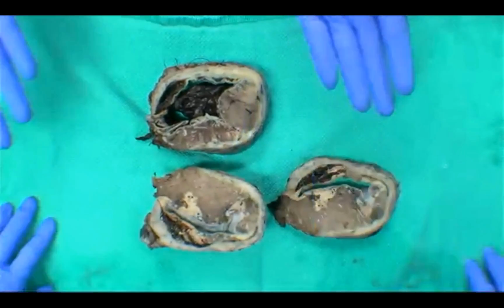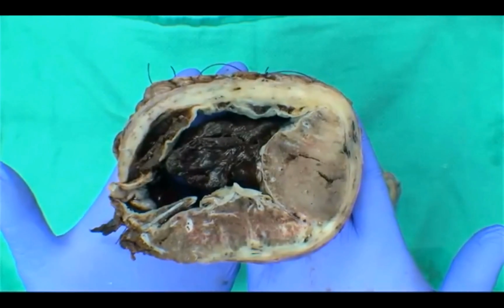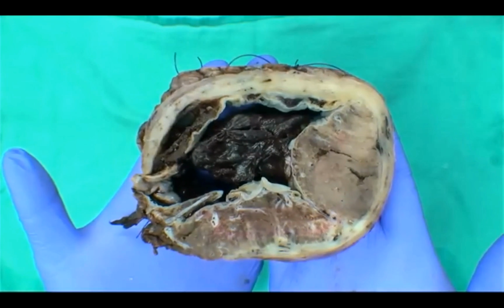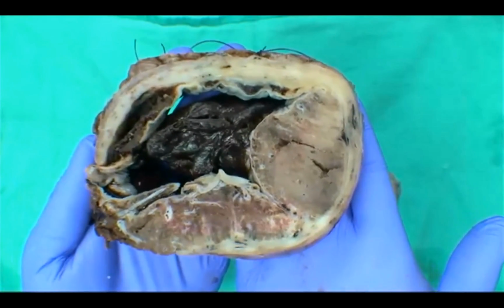So I'm going to pick up these individual slices and then. That's my hand modeling for today. So this is something that you can expect on cut surface. Actually, we got more than 2, but yes, sometimes they come in groups. We're not here to brag.